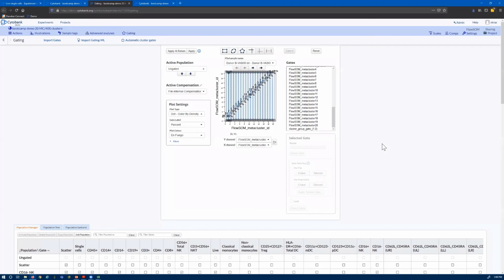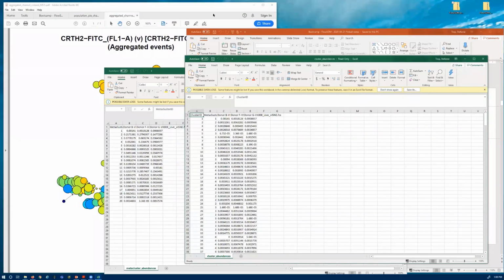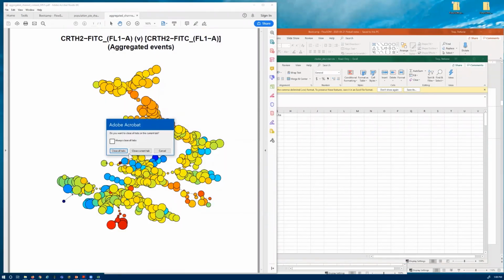Okay, I'm going to take one last question, which has to do with metaclusters and also pertains back to what we just talked about. How do we know if increasing metaclusters or the clusters improves the FlowSOM? Steph, would you like to take this one, or Chenjun, either one of you? Sure. Yeah.